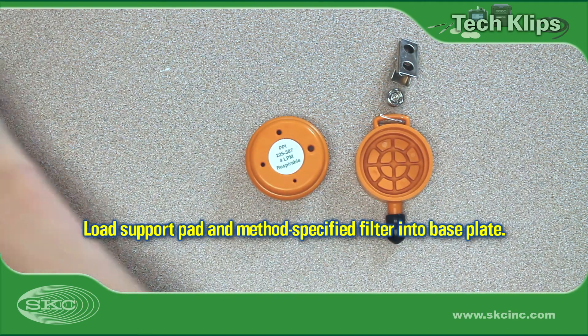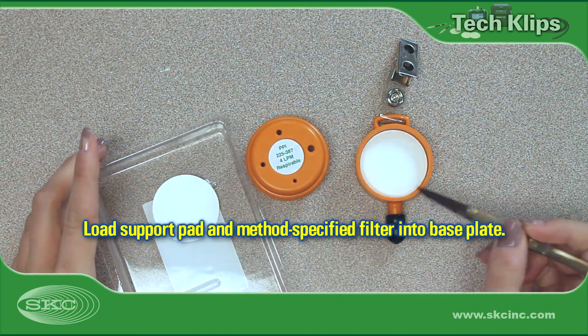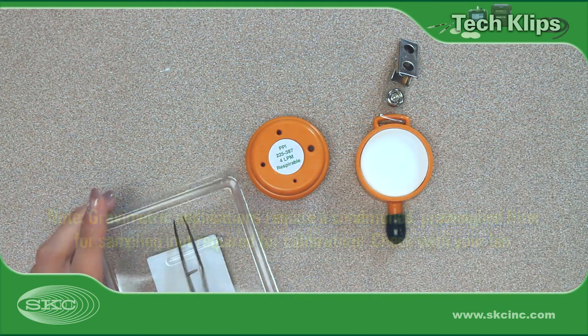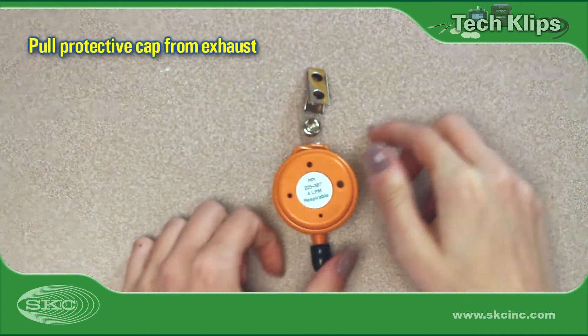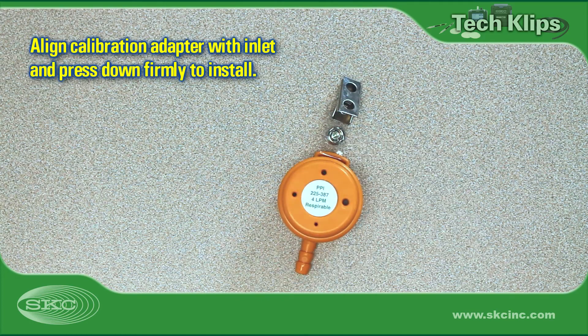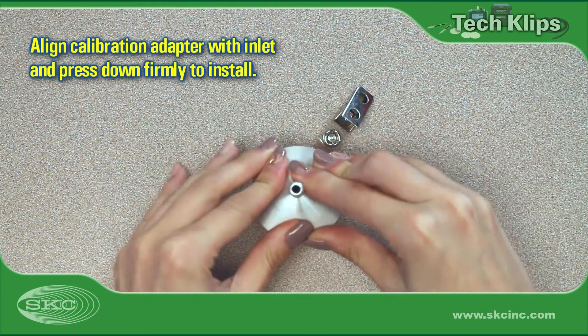Remove the shrink wrap before proceeding. Use forceps to insert a 37 mm support pad and filter into the sampler base plate. If you intend to sample for gravimetric analysis, you will need to have filters conditioned and weighed at a laboratory before sampling. Install the inlet on the base plate, pressing down firmly and evenly for an effective seal. Remove the protective cap from the sampler exhaust. Install the calibration adapter on the sampler inlet.